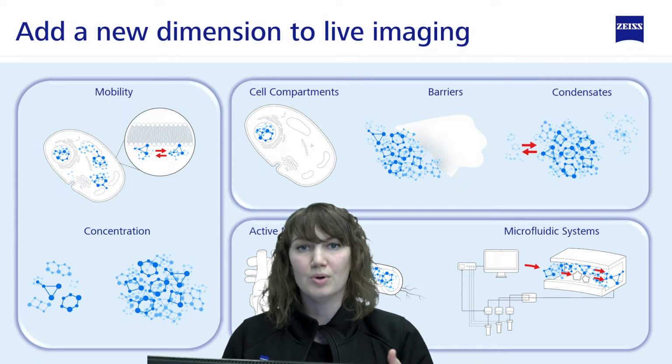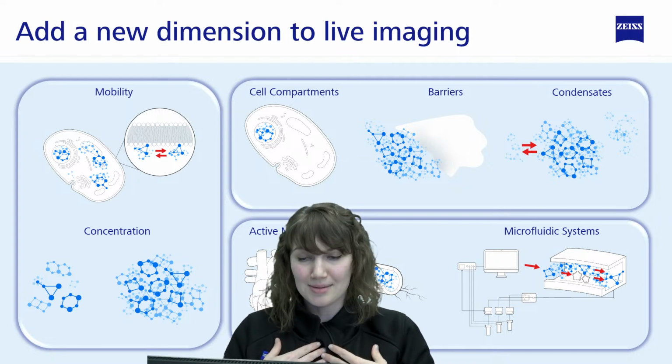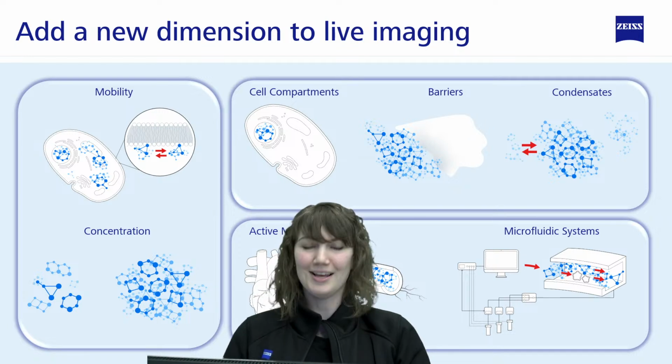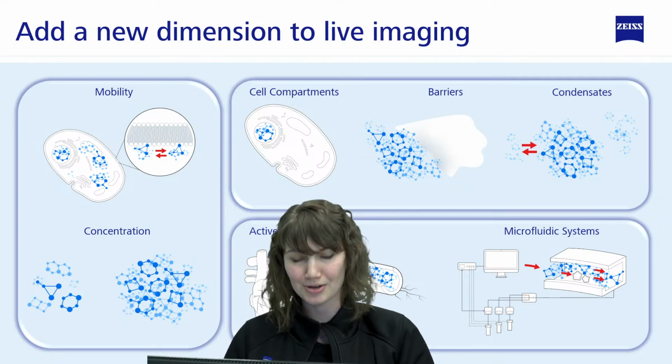I'll sort of go into what you would do if you wanted to look at the barriers and condensates. I don't have any examples of that in-house right now, but if you guys want to do a demo with us, feel free to reach out, and I'll happily put your samples on the system and show you.